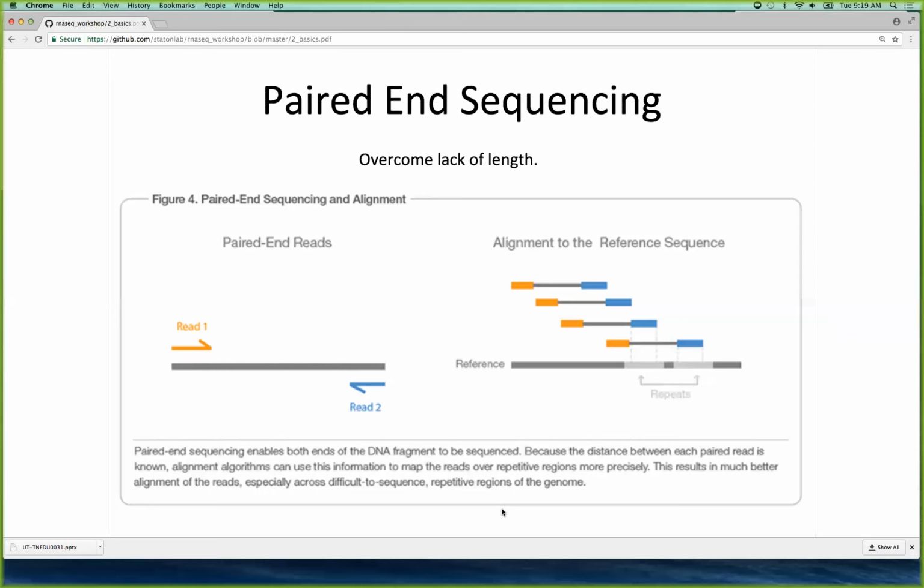And the problem with the nanopore sequencing, which you guys may have seen, PacBio, Oxford Nanopore, you can get super long reads. You can get 50,000 bases, but you're getting 15 to 20% error, which is a lot of error. With Illumina, you're getting under 1% error. So it's a trade-off. And so a lot of projects, especially genome assemblies, you're looking at a hybrid approach. You want to do a little bit of both. With RNA, it's pretty common to just stick with Illumina, because transcripts are already pretty short, so the short reads aren't as big a problem as they are for genome assemblies, which is quite a problem.